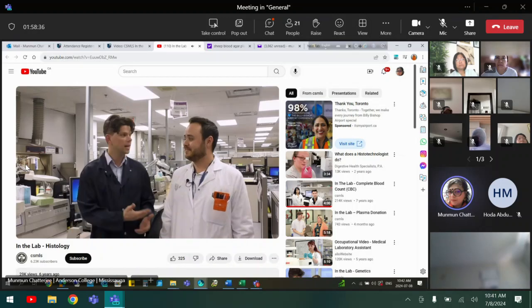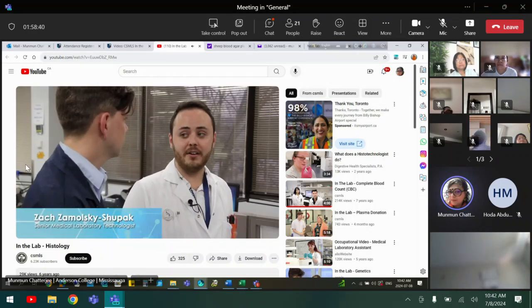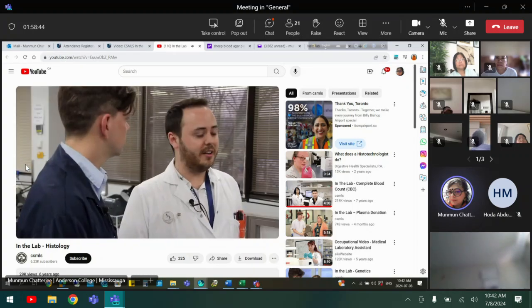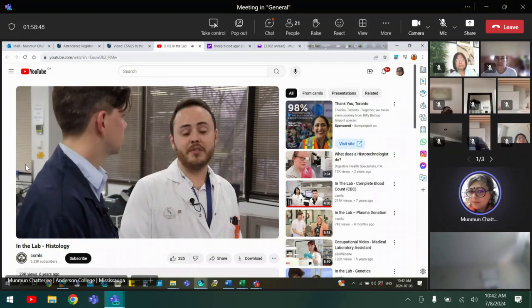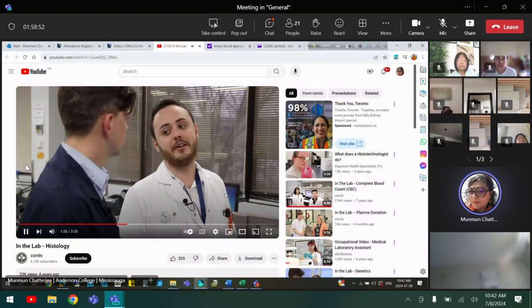I'm in the lab with Zach. Zach, what's your role here? I am one of the senior medical laboratory technologists in the histology department. What do you do? On a daily basis, we get in samples from across the province, we process them, we gross them, we embed them, and we send them to doctors on slides for them to make a diagnosis.